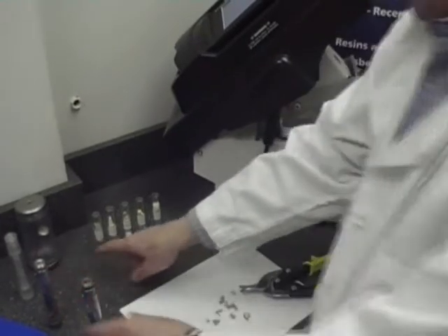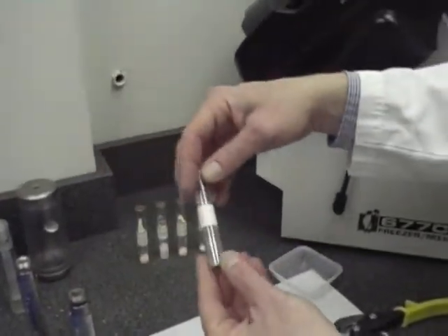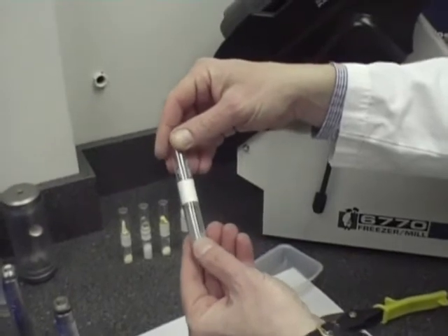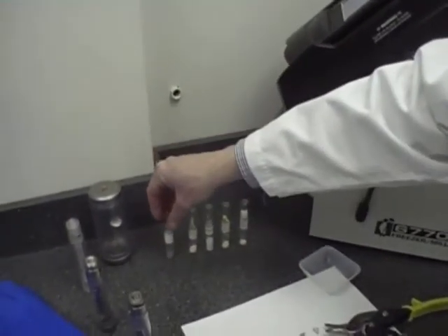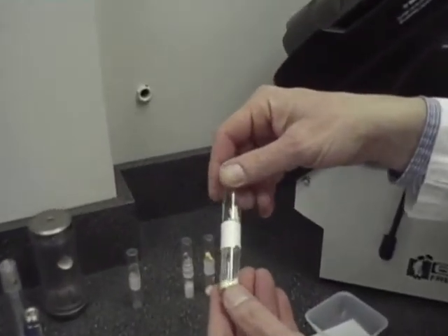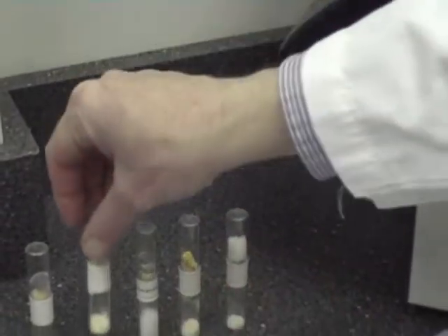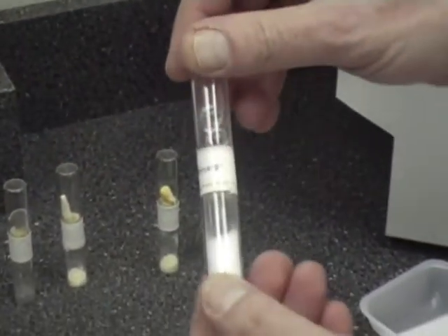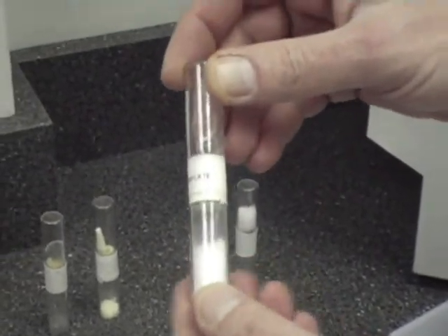Here you can see some before and after samples that were processed in our Freezer Mill. As you can see, this is a textile, a piece of fabric, finely ground. For forensic applications, this would be a piece of bone that is typically used to extract DNA. Polymers are very easily ground in the 6770 Freezer Mill, and here's an example with some methacrylate.